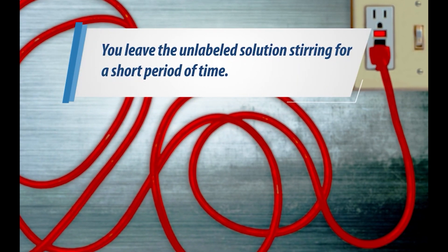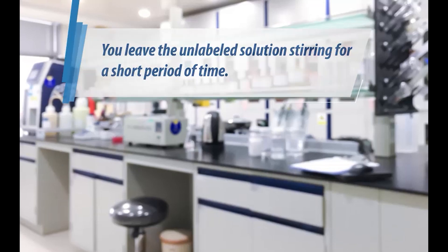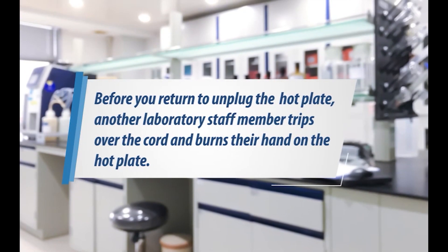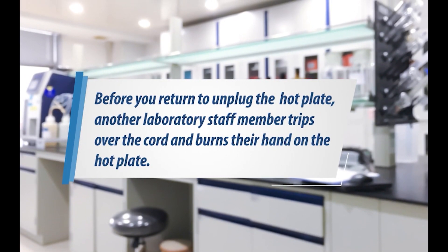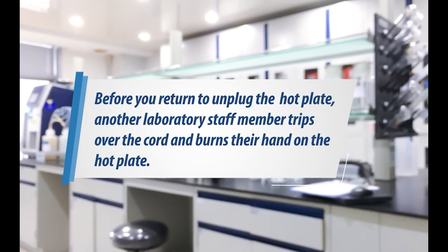You leave the unlabeled solution stirring for a short period of time. Before you return to unplug the hot plate, another laboratory staff member trips over the cord and burns their hand on the hot plate.